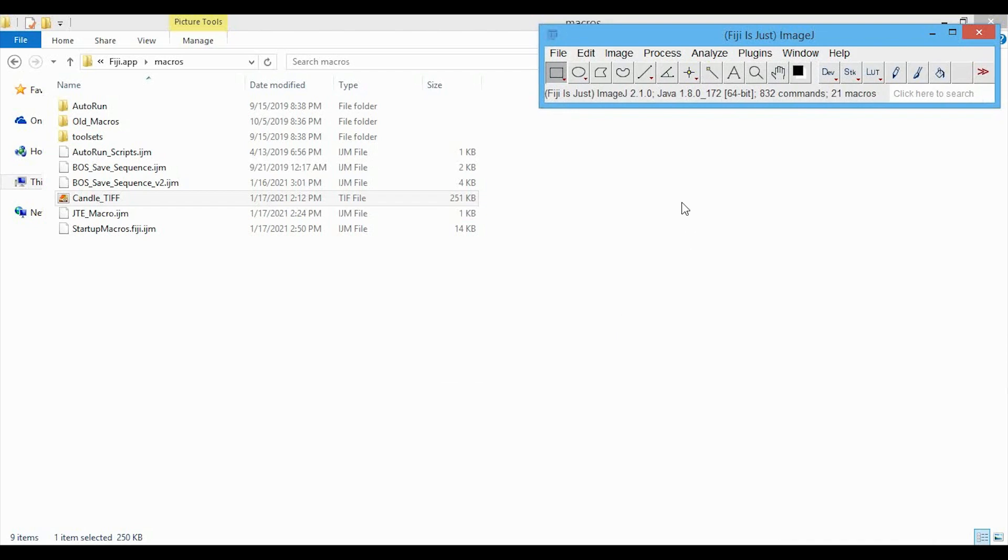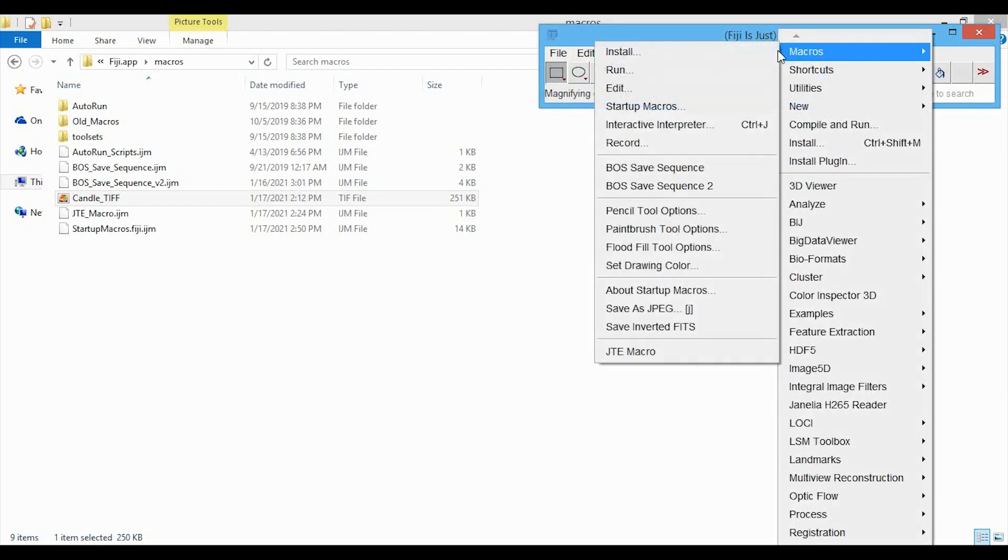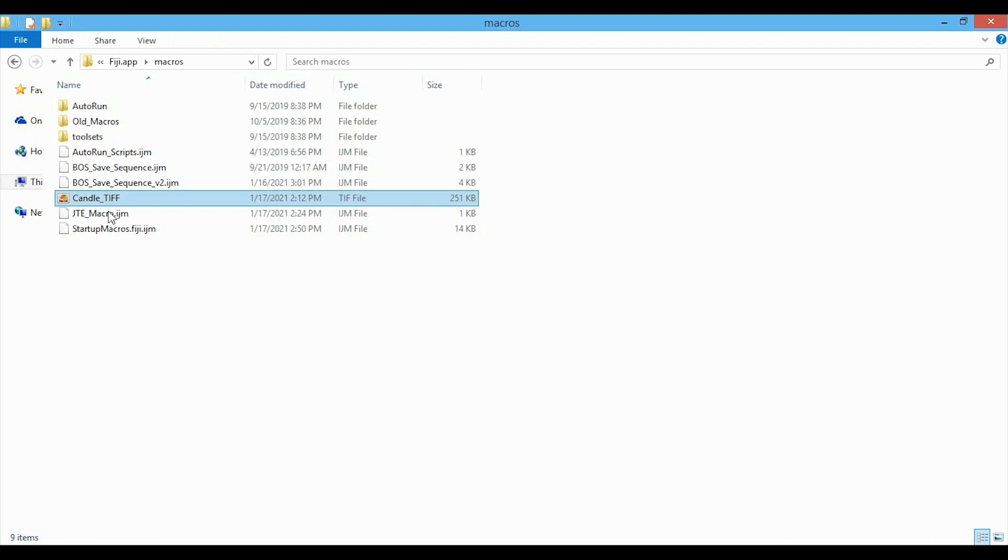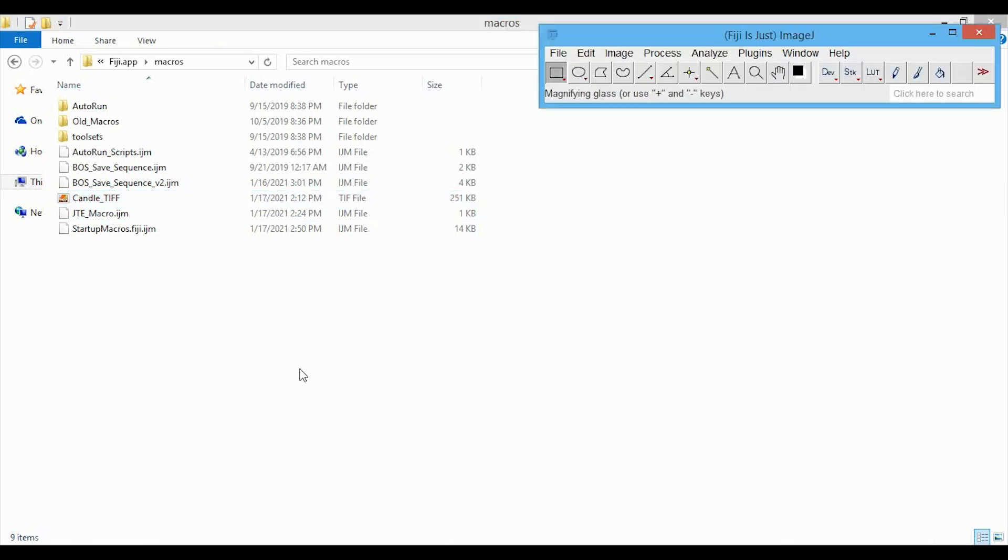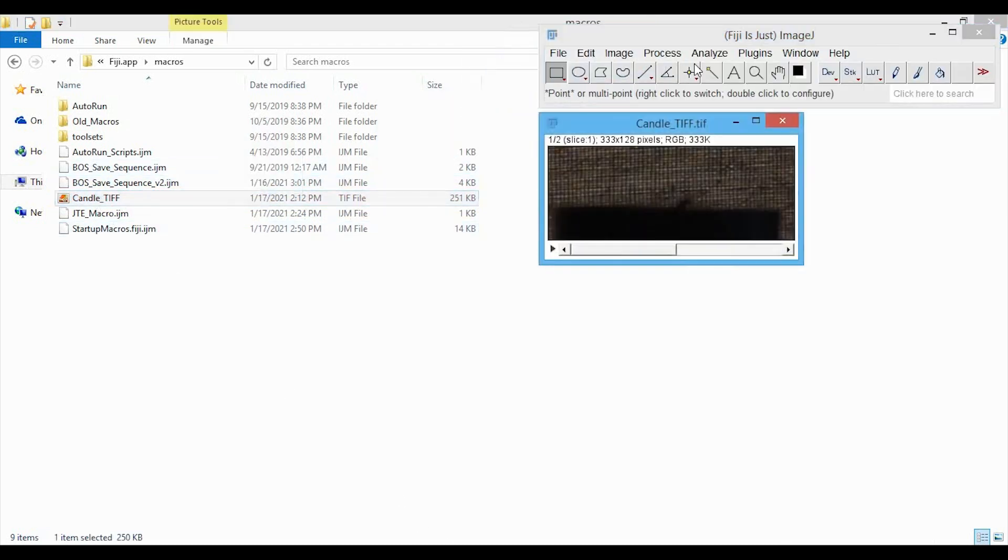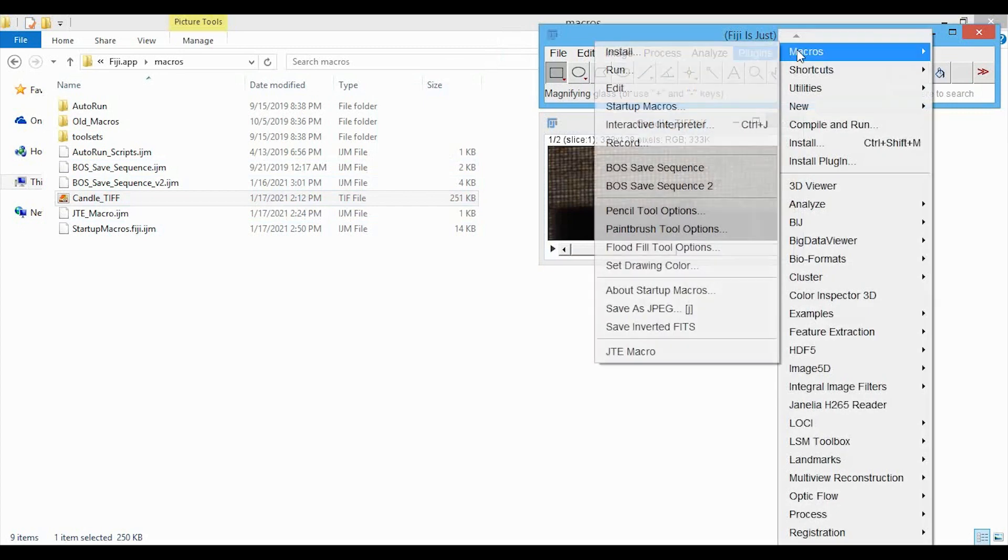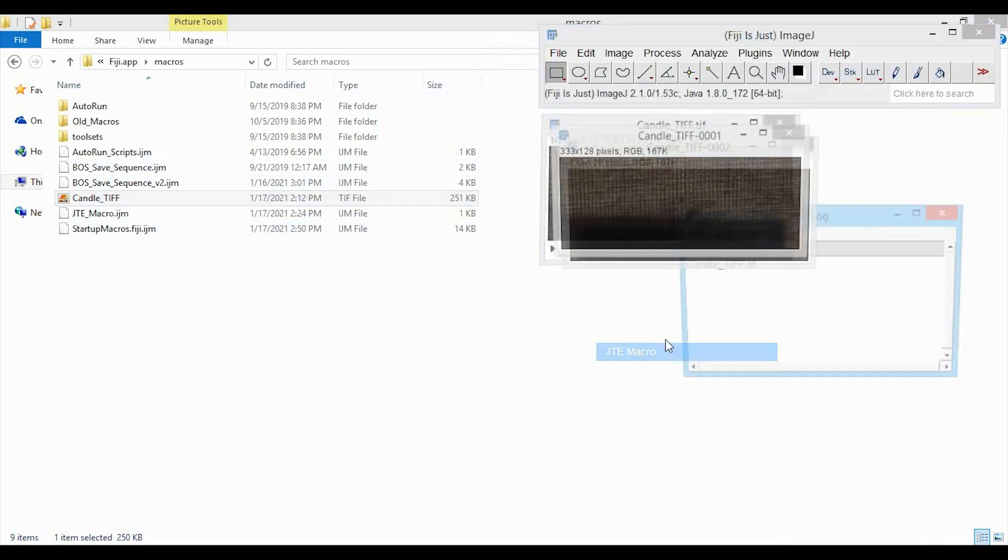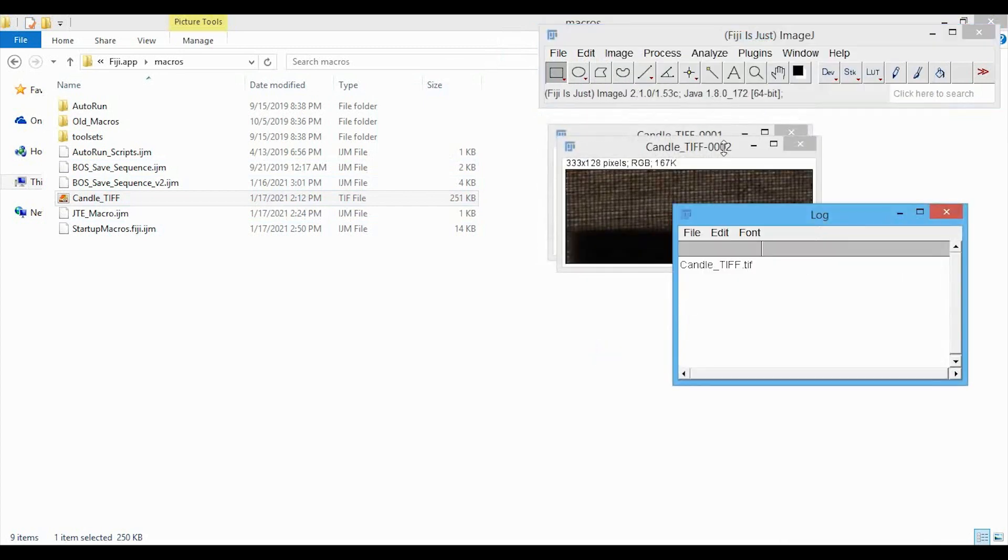And here it is opened, and we're going to go to Plugins, Macros, and now you can see it at the bottom. We can just try this out by, again, dragging in this stack, and then Macros, JTE Macro, and then you can see it works just fine, so it'll always be available when you open up ImageJ.